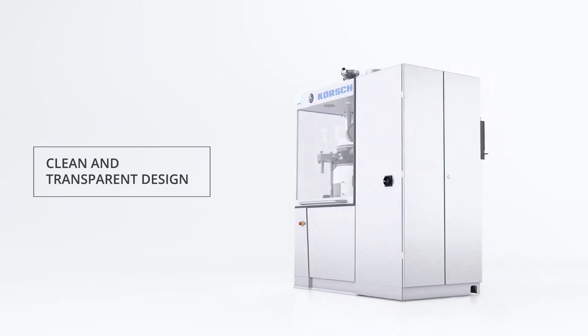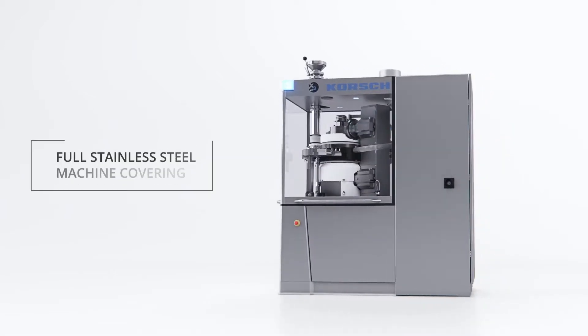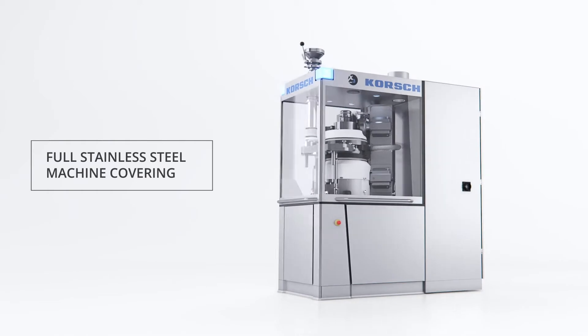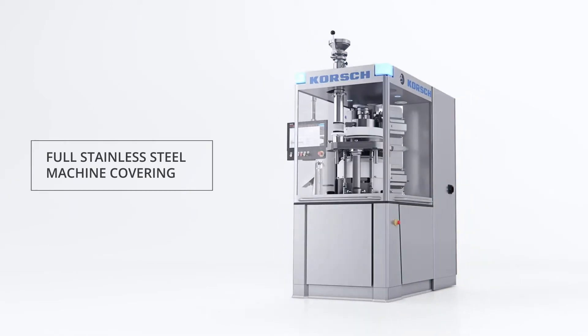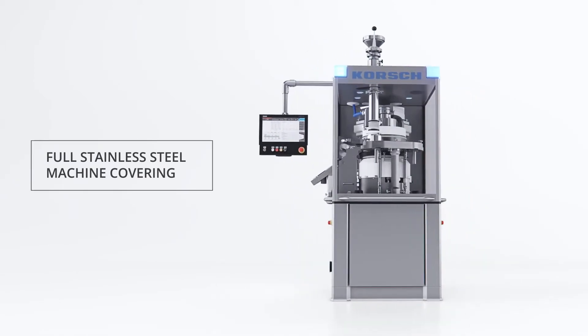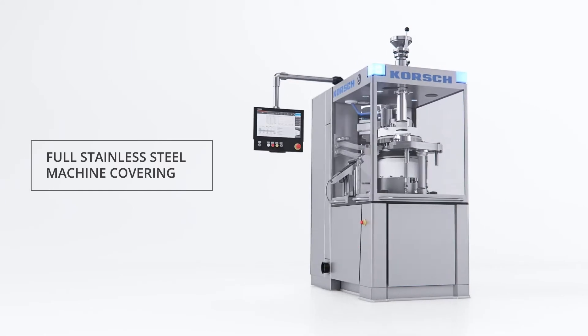The X3 is a single-sided rotary tablet press that redefines flexible technology with a new approach to architectural and ergonomic design elements, which were previously available only on larger machines.